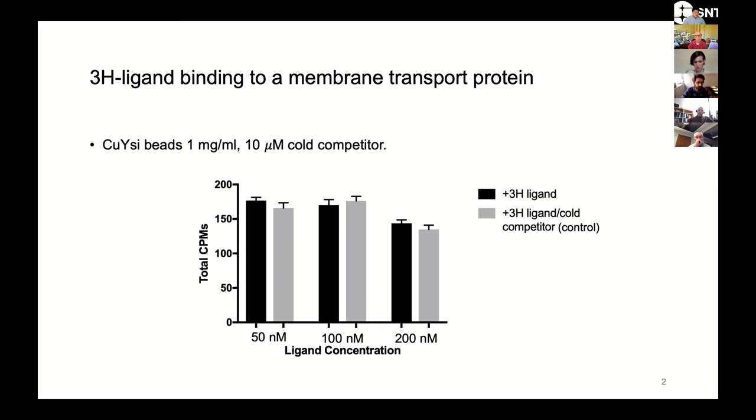This is one of the first experiments that we did here. We took our purified protein, mixed it with some copper bead side beads at about a milligram per mil, and added varying amounts of our 3H-labeled ligand. In the gray bars here, you can see these are our controls, where we've added 10 micromolar of a cold competitor, basically to compete off the counts that are bound to the protein. What you can see is that our total counts are really low, and there's really no difference between the test and the control. We did many experiments like this, where we tried to optimize the assay, and we just really didn't get anywhere.